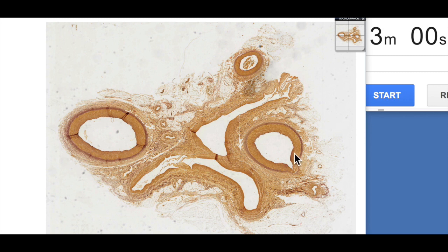So we're using this section. It's not a grumpy, sad face, looks a little bit like a sad face. But we've got a couple of muscular arteries here in a vein, another vein, and a little muscular artery. So we'll talk about that in the next three minutes. Okay, so let's start our three minutes.